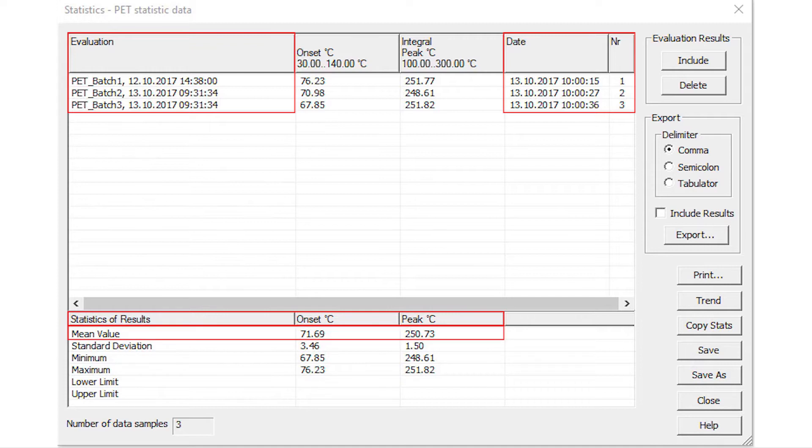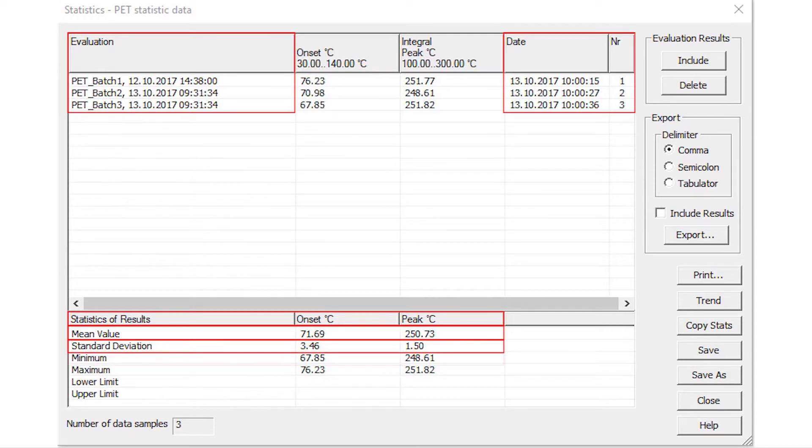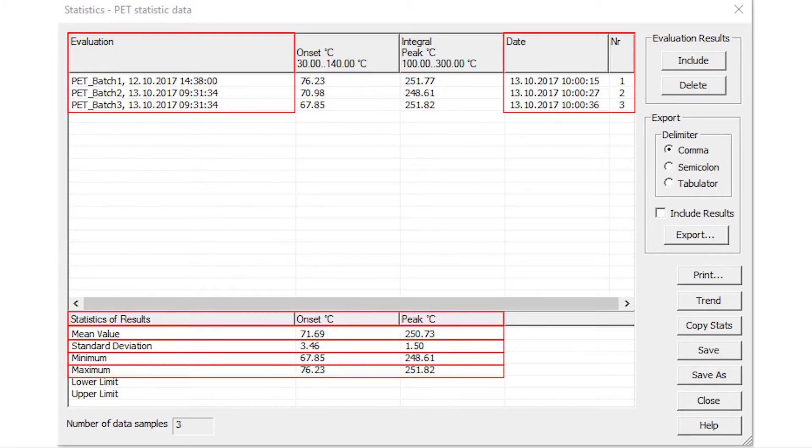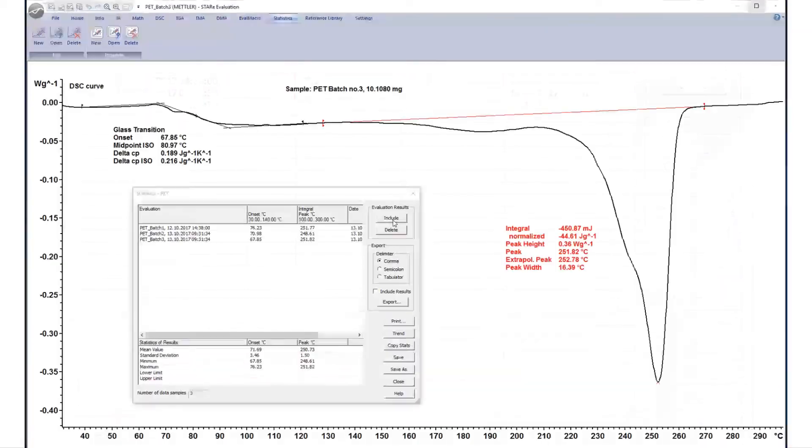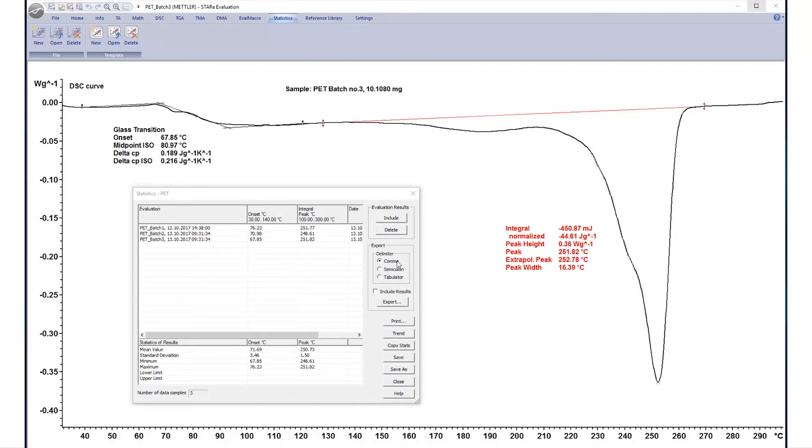For example, mean value of the evaluation results, standard deviation of the evaluation results, minimum result value, maximum result value, and number of data samples.